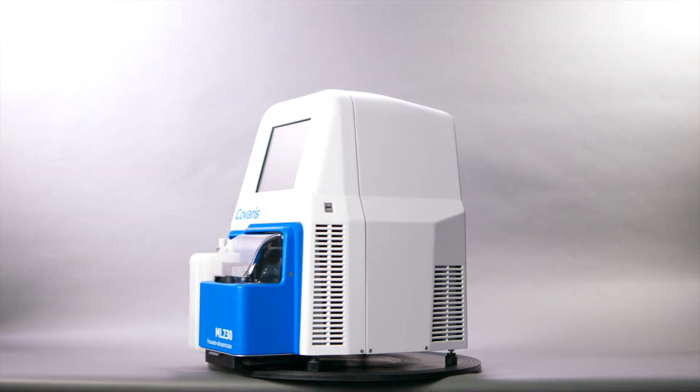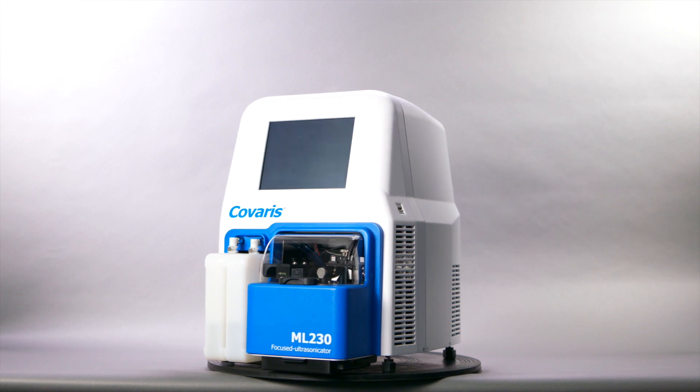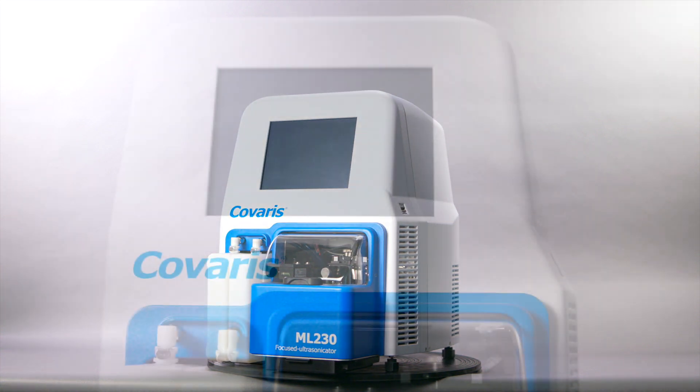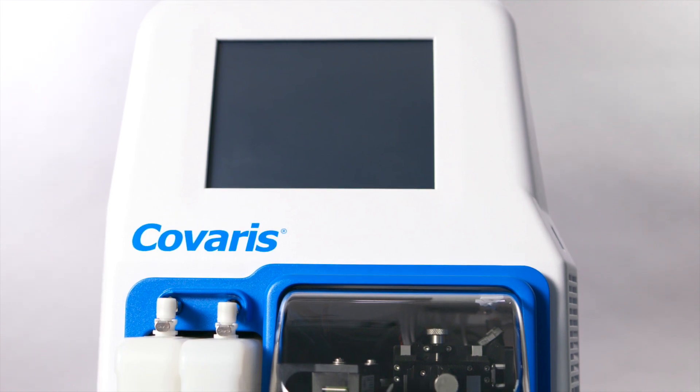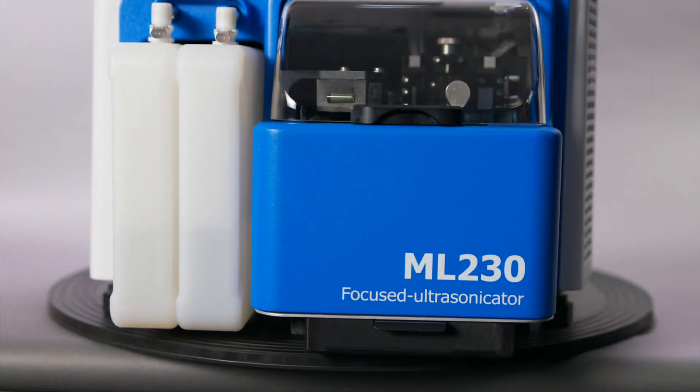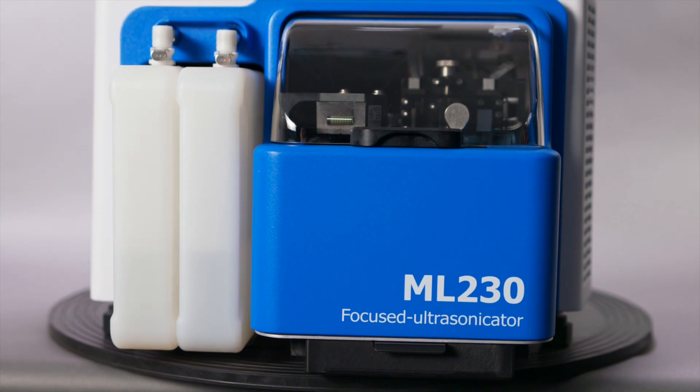The ML230 Focused Ultrasonicator is the compact, parallel sample processing platform powered by Covaris Adaptive Focused Acoustics. The ML230 Focused Ultrasonicator enables parallel processing of up to 8 samples simultaneously.